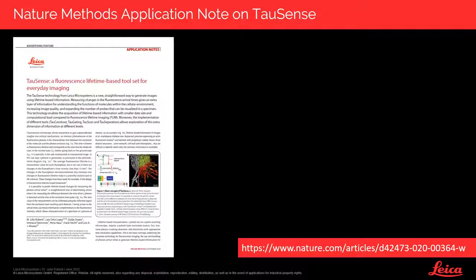These tools that I explained, tau contrast and tau separation, are part of our new tau sense technology in our STELLARIS confocals. Again, you can find more information on this technology, on tau sense, in a Nature Methods application note, and here is the address. We will share it with you so you can get more details.